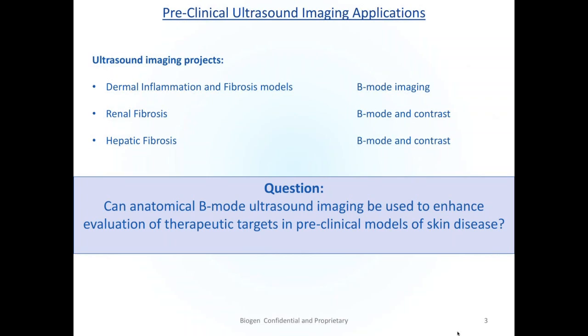So this brought us, really at the beginning, to the question of whether ultrasound imaging could be used to enhance our evaluations of the targets that we were developing in these different preclinical models of skin disease.